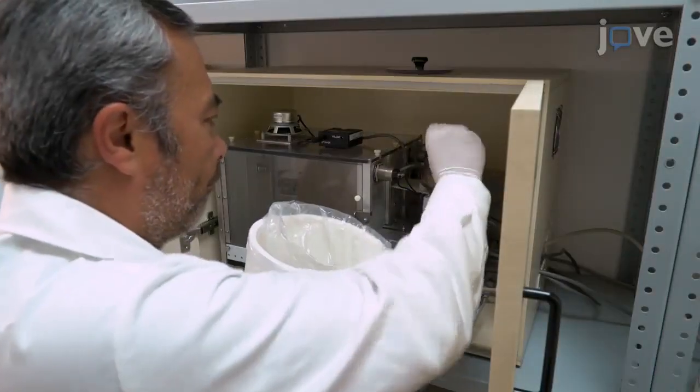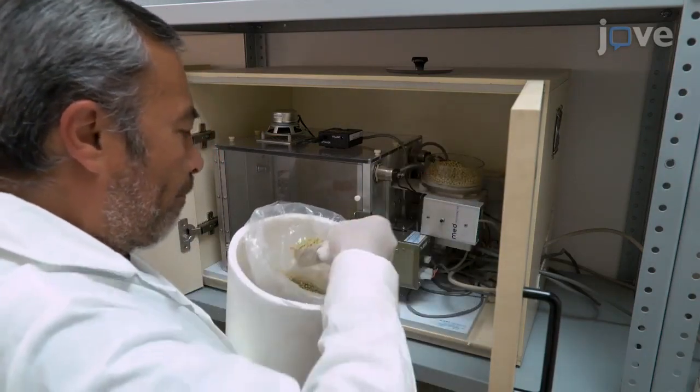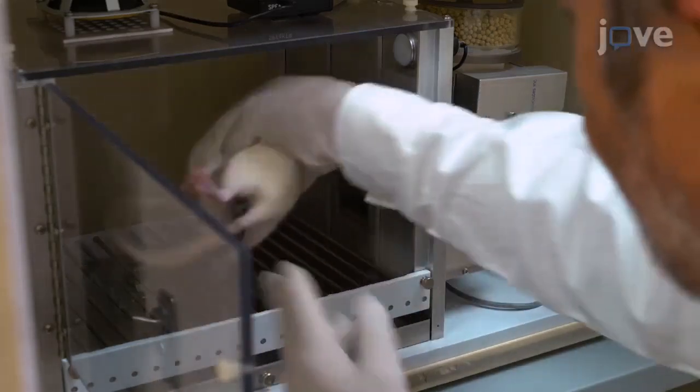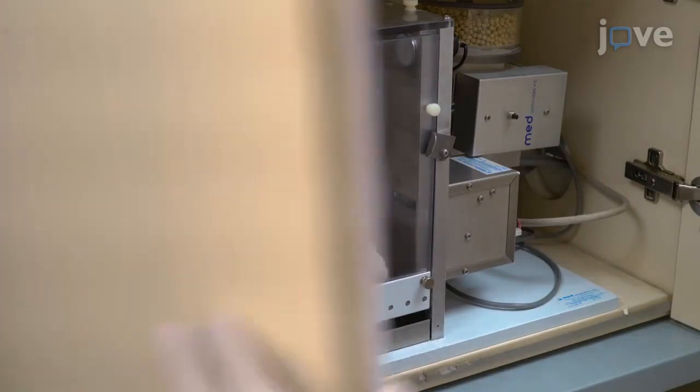After beginning the food restriction regime, add 60 food pellets to the food receptacle to habituate food neophobia before introducing the rats to the conditioning chambers without the initiation of any protocol for 30 minutes to habituate the exploring responses.